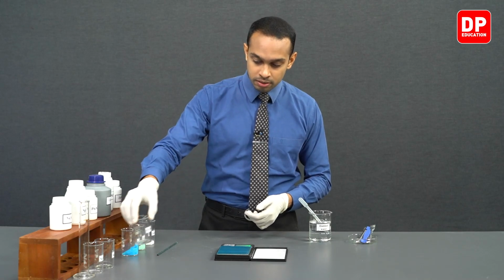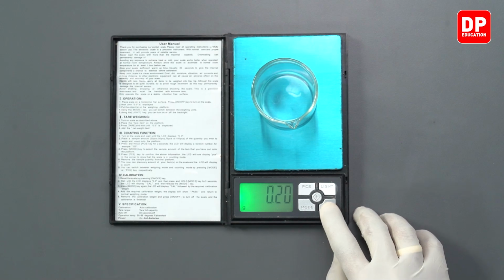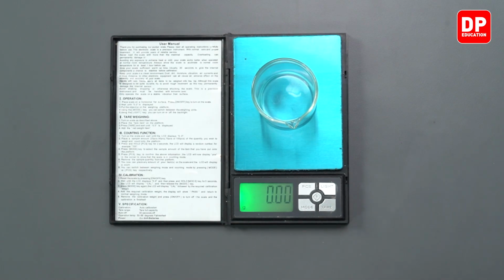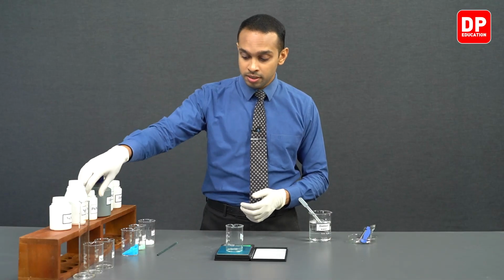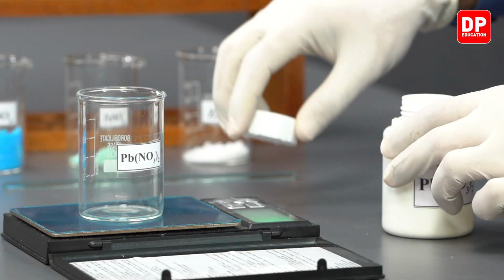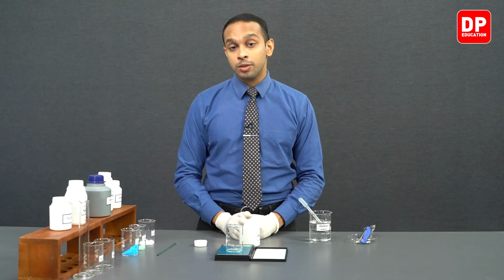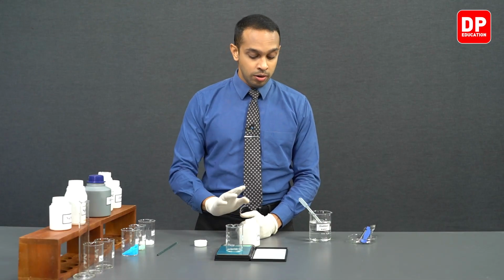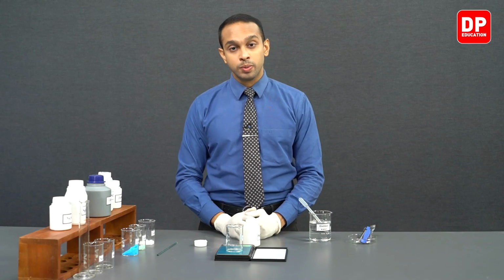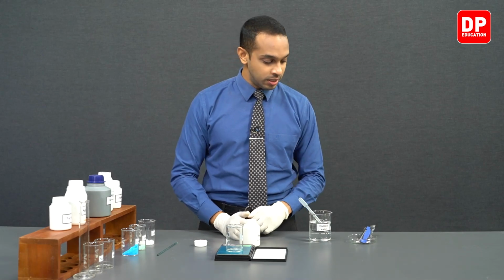And then we will take lead nitrate. We will tare the digital balance first. And then we have our lead nitrate container, and we are going to measure exactly 16.56 grams of lead nitrate to prepare 1 mole per decimeter cubed solution of lead nitrate with a volume of 50 milliliters.